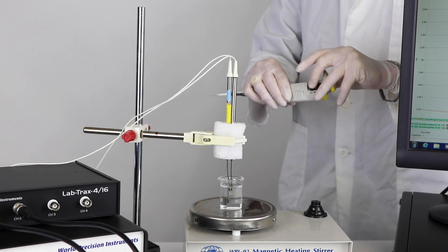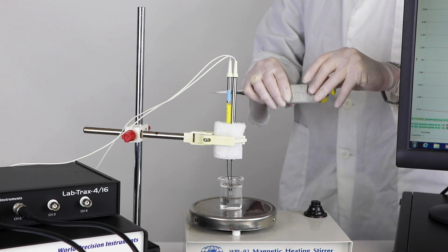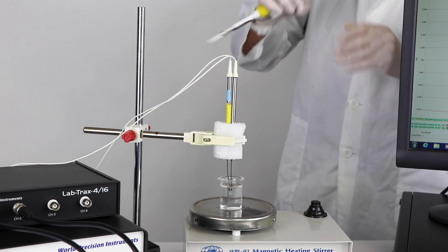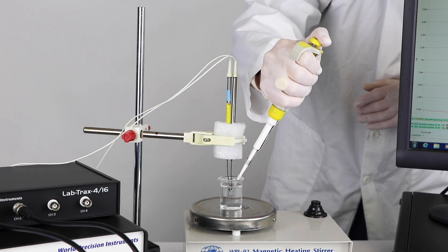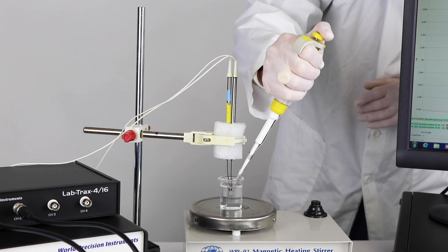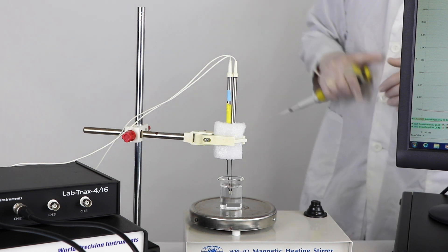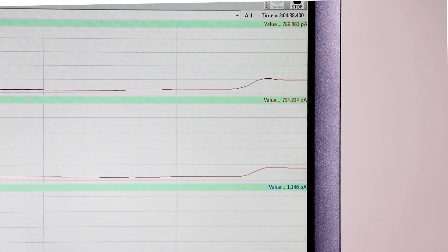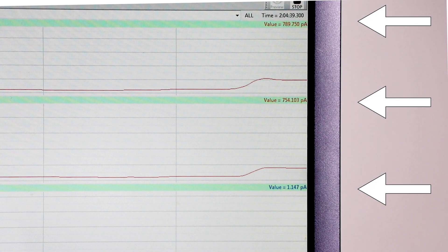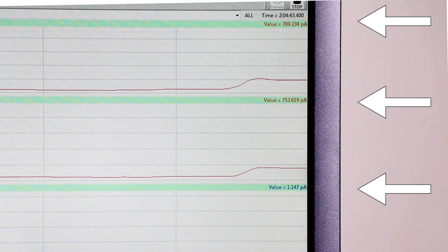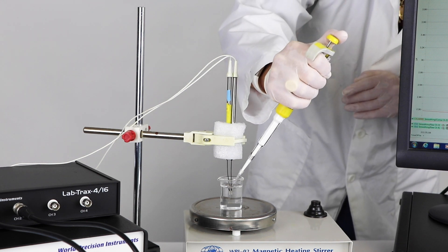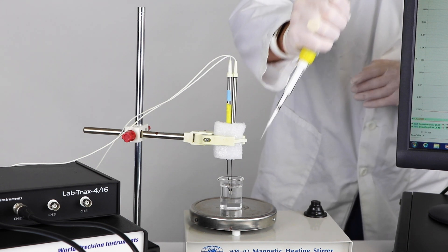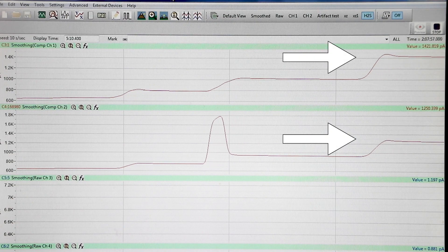After the sensor has polarized, use a pipetter to inject an aliquot of the calibration standard. Start with two microliters of one millimolar hydrogen peroxide, then allow 30 seconds while LabTrack records the data — we are waiting for the data trace to plateau. Then inject twice the volume of the first aliquot and allow another 30 seconds until you see the data trace plateau again.